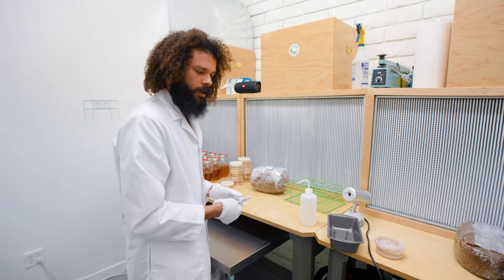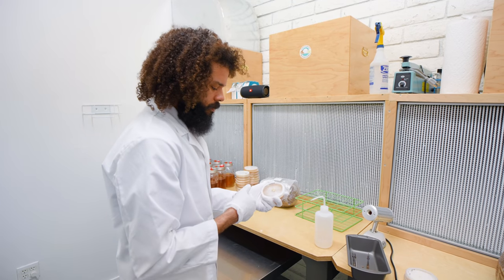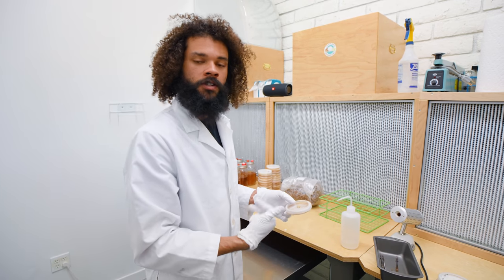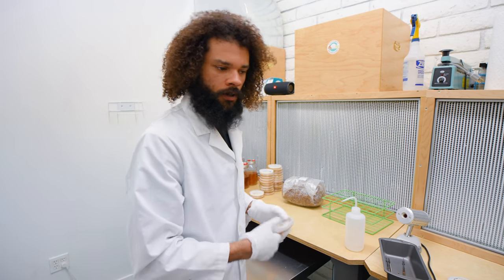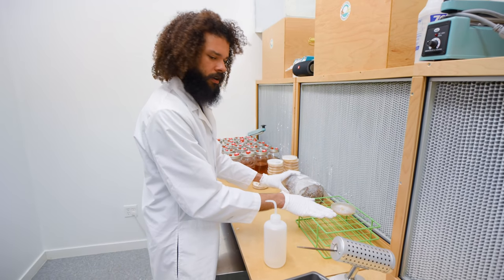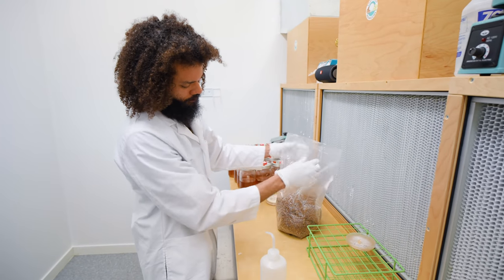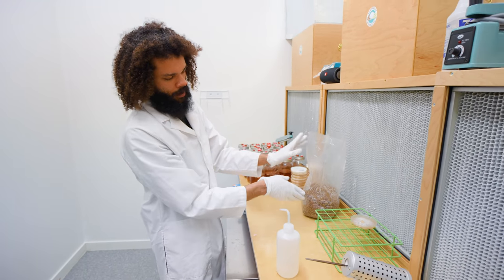I have some pre-sterilized bags of spawn. We'll be taking some petri plates and using them to create a bag of spawn called the G1 or Generation 1 bag. That will then be used to produce 10 more Generation 2 bags, and from there we can move those into production bags and move to fruiting. We'll heat our scalpel up again — the petri dish is awaiting transfer and we have a bag of sterilized grain, which in this case is sorghum grain.